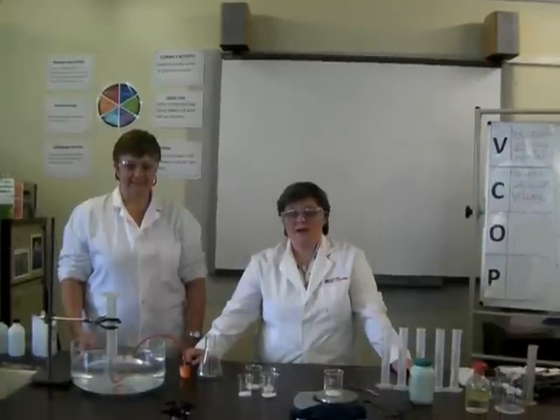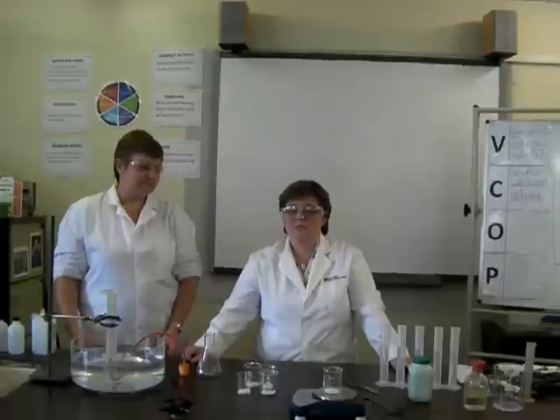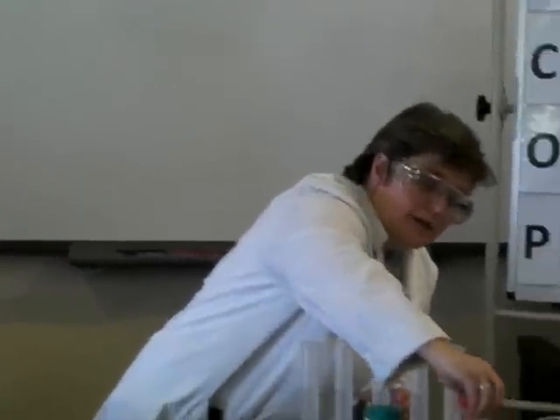Today we are looking at how concentration of an acid affects how quickly the chemical reaction takes place. So we're doing rates of reaction. We are looking at the reaction between calcium carbonate and hydrochloric acid.